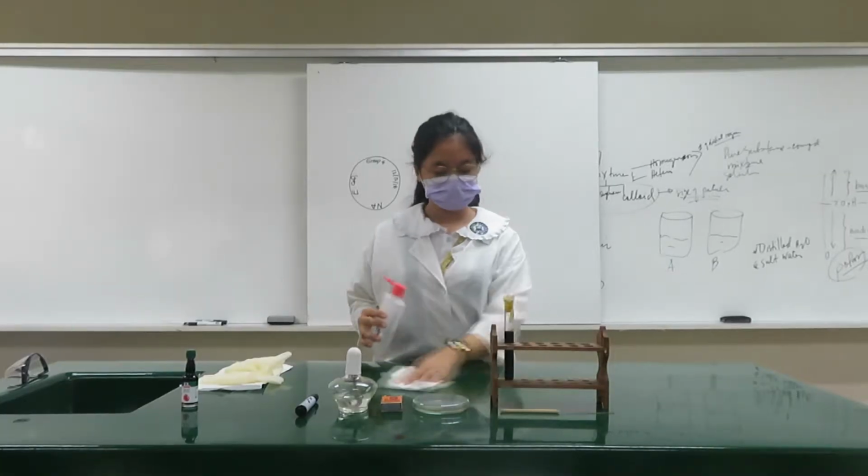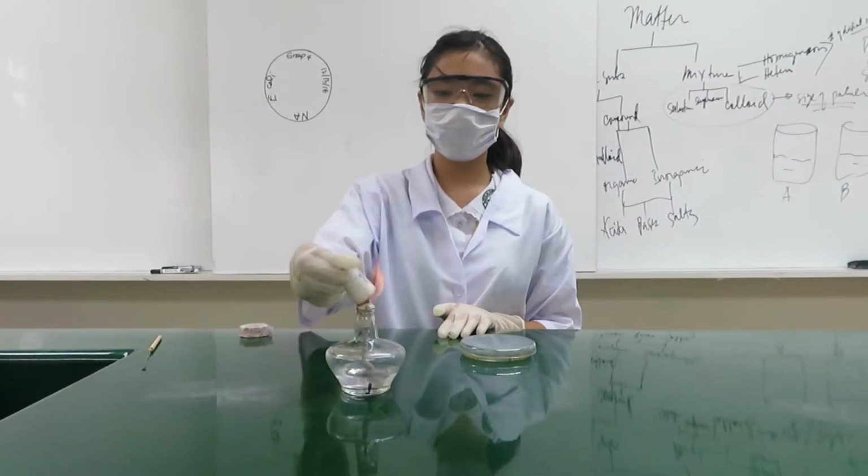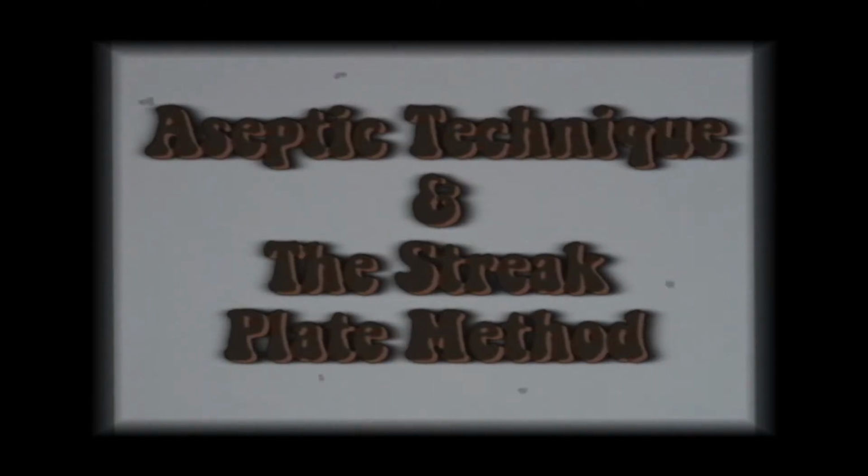Hey there, welcome back. For today's video, we're going to demonstrate the proper way of doing the aseptic technique and the streak plate method. But before we advance to the procedures, let us define them first.